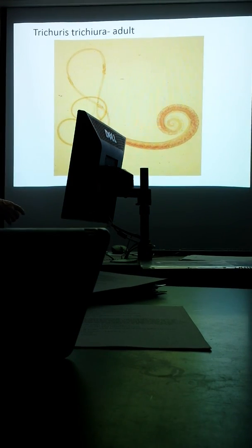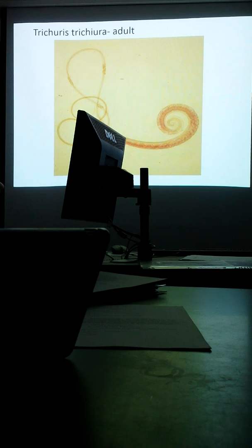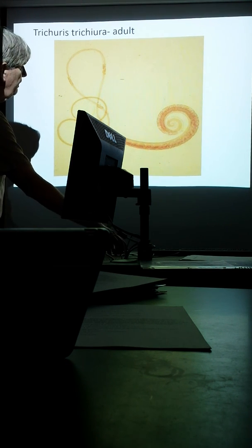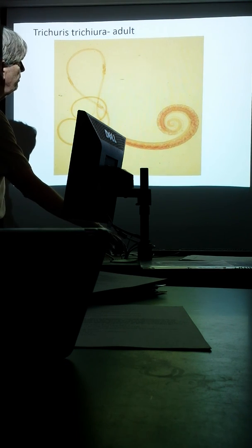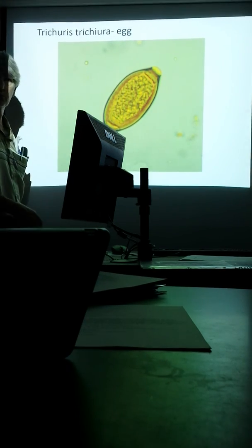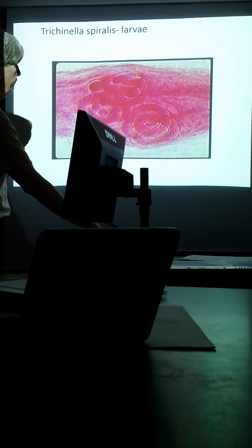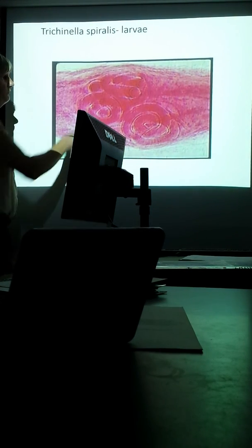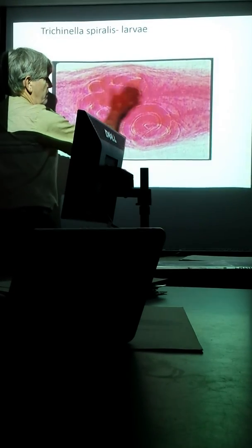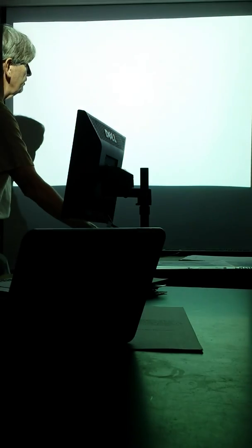The Trichuris whipworm got over there on the scope, so again, the head end is actually up on this little tiny end, and you can hardly see. And anyway, so again, fairly distinct in terms of its appearance relative to the others. Here is the egg, and again, 2 nice openings, 2 opercula on each end. And then here is the Trichinella. So you see these cysts, and again, this red tissue in the background is muscle. It's typically target tissue, right? So that's the red.